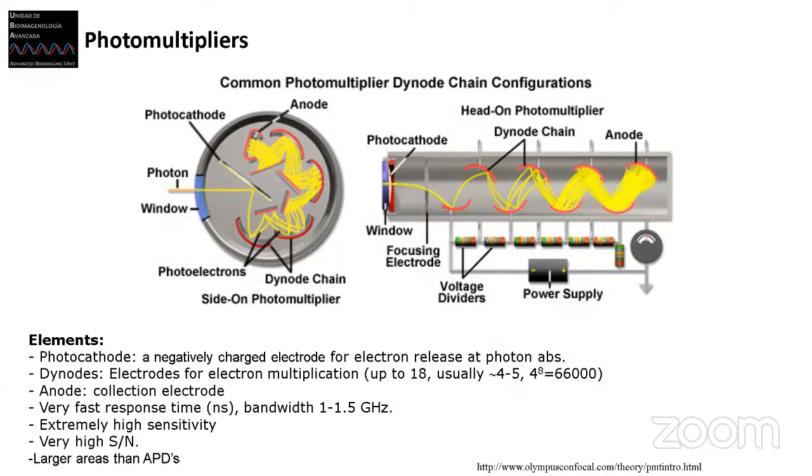The interesting thing is, we can always put more voltage here, but the more voltage we put, we will start to get some release of photoelectrons from the dynode that doesn't mean they are coming from the photons that hit the photodetector. So this is noise. We will play around with this in the microscopes. If we play with more gain or less gain, you will see that you get more counts, but in the end you get a histogram which is not packed. It's really noisy because you have many photons which do not belong to the signal.